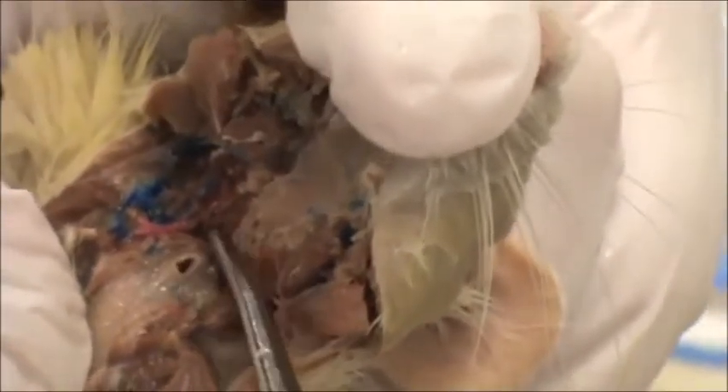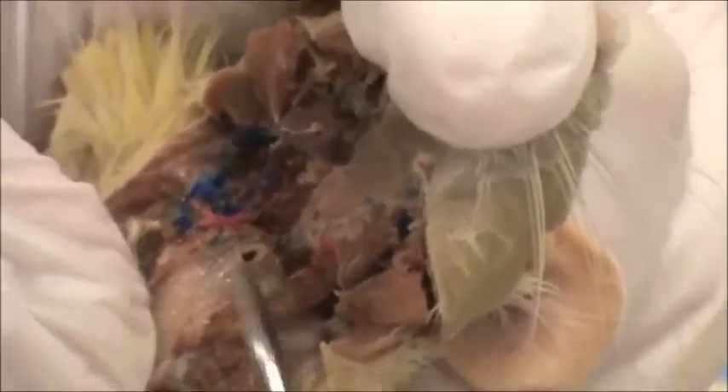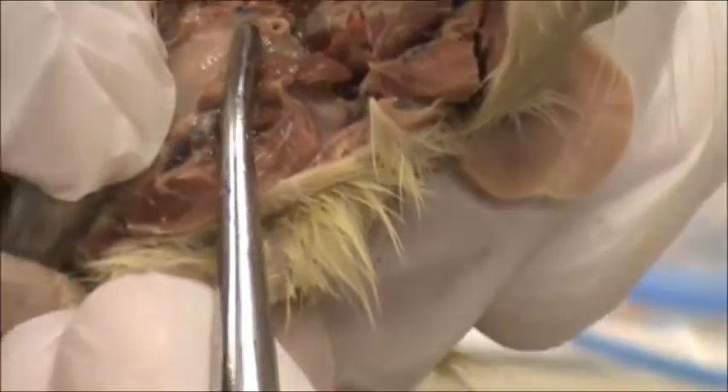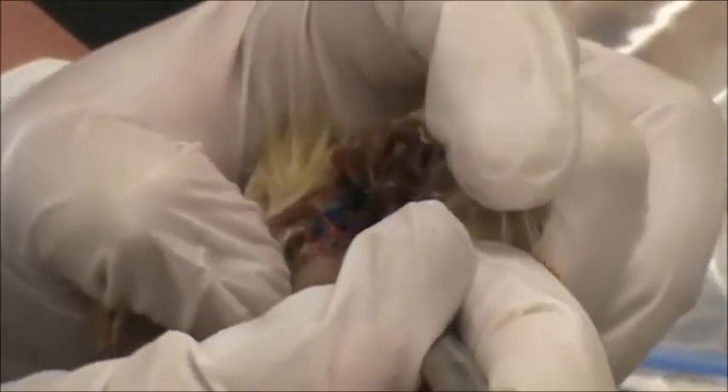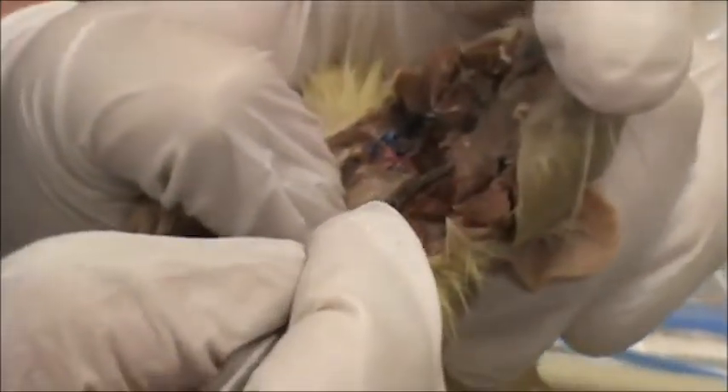In front is the glottis and that opening leads to the lungs. When the rat eats, you don't want food to go down the glottis. So in front is this little flap called the epiglottis. Food will push against that and cover the glottis as it goes down the esophagus or the esophageal opening. So it goes: posterior nares, esophageal opening, glottis. And then here is the tongue.